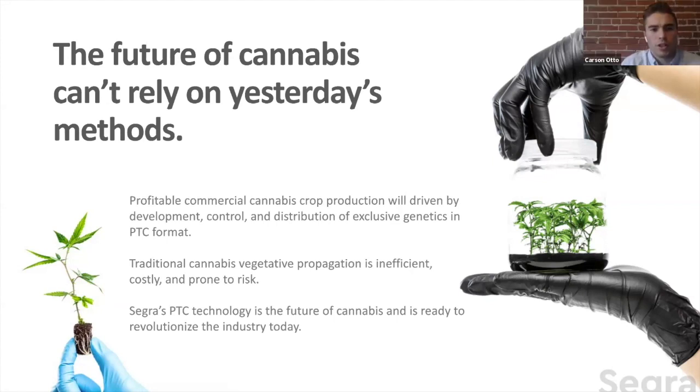We've had a couple questions based on the actual media that you use for tissue culture. Can you comment on the hormones that you use for multiplication? I cannot directly explain what kind of hormone. This is, I think, a Segra trade secret.